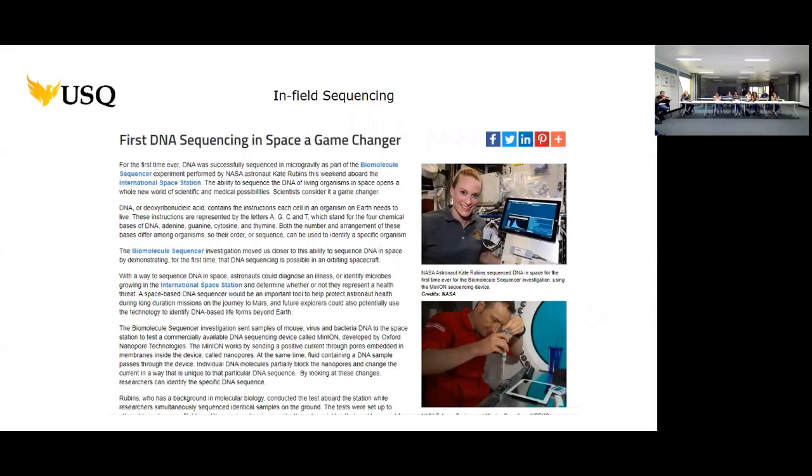But you've got to get over that problem of extracting your DNA in the field. High molecular weight, high purity. So essentially, if you want to make this work in the field, you do need to think about how you can jump over all of those hurdles. And I'm not saying that you can't, because I think that you can, and I think this is a really exciting space to work in and try and get this to work. I think it is possible, again, depending on your application. And I think what you'd want to do is make sure that for that application, you can make it work in the lab before you go anywhere near the field.